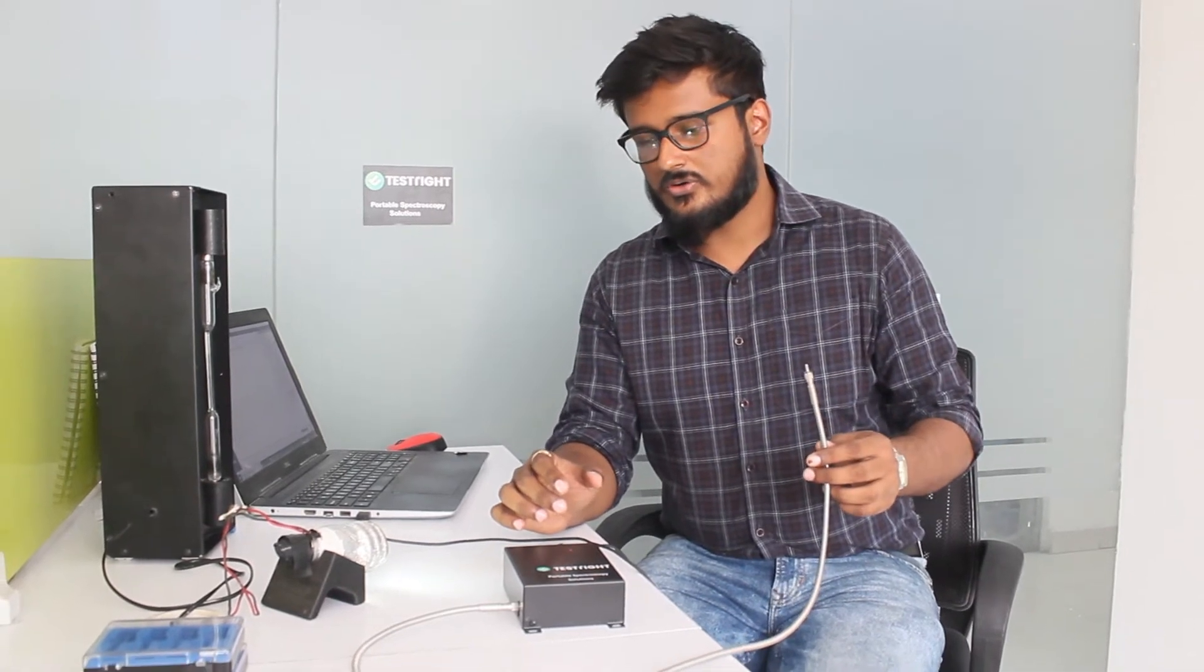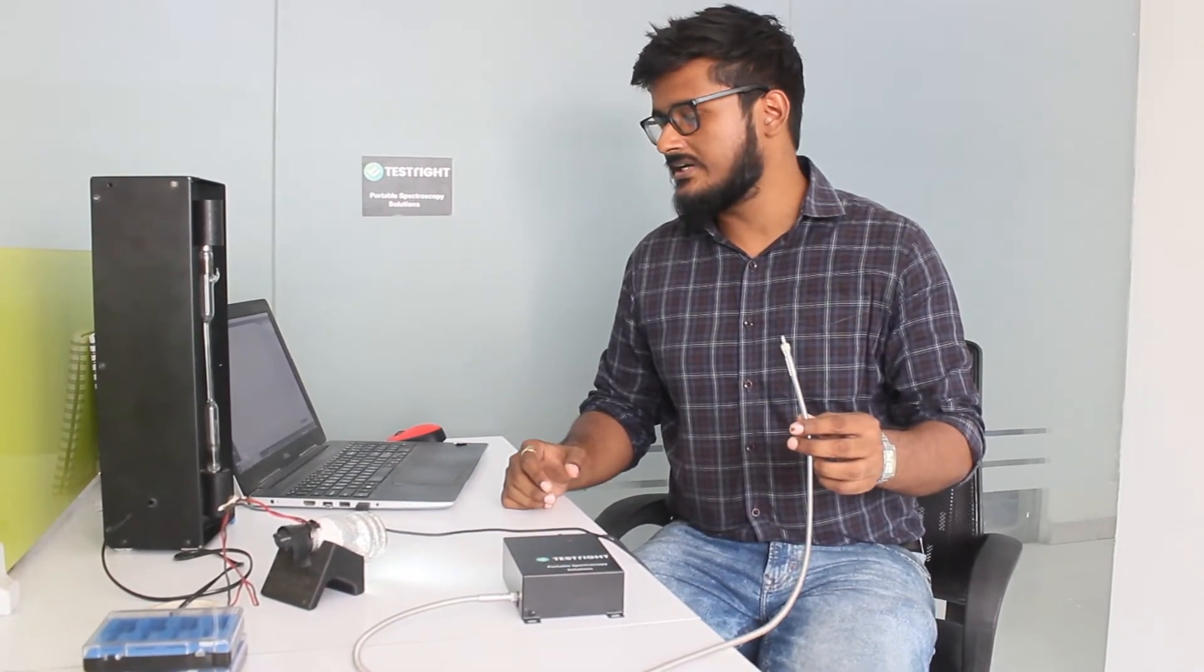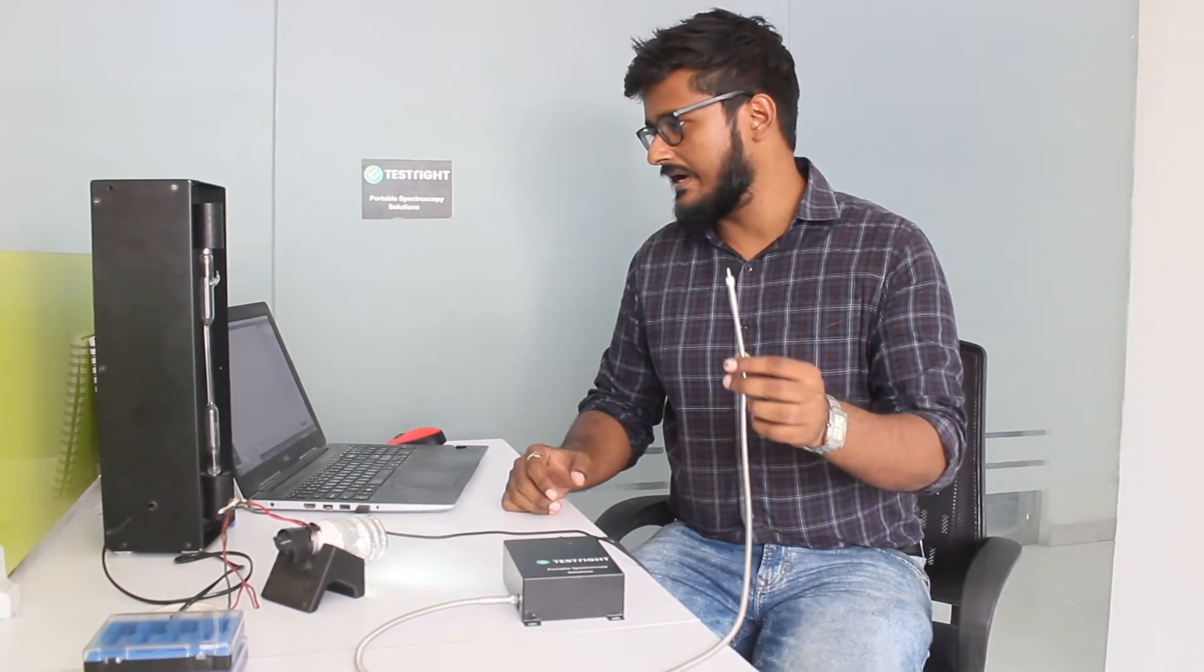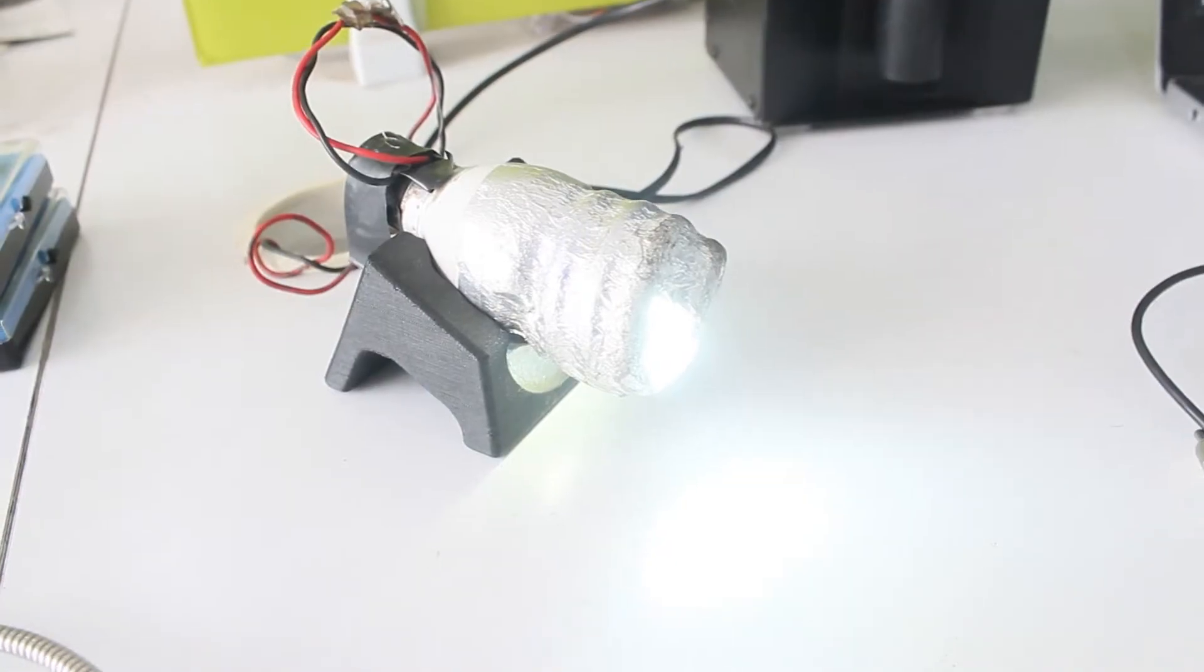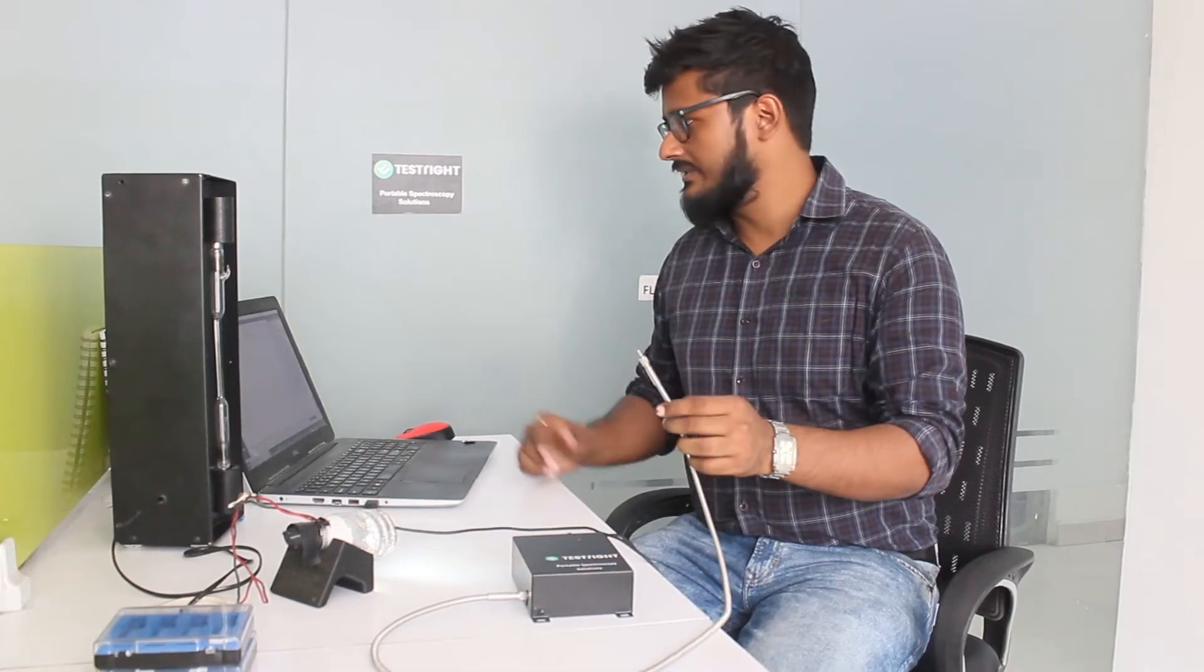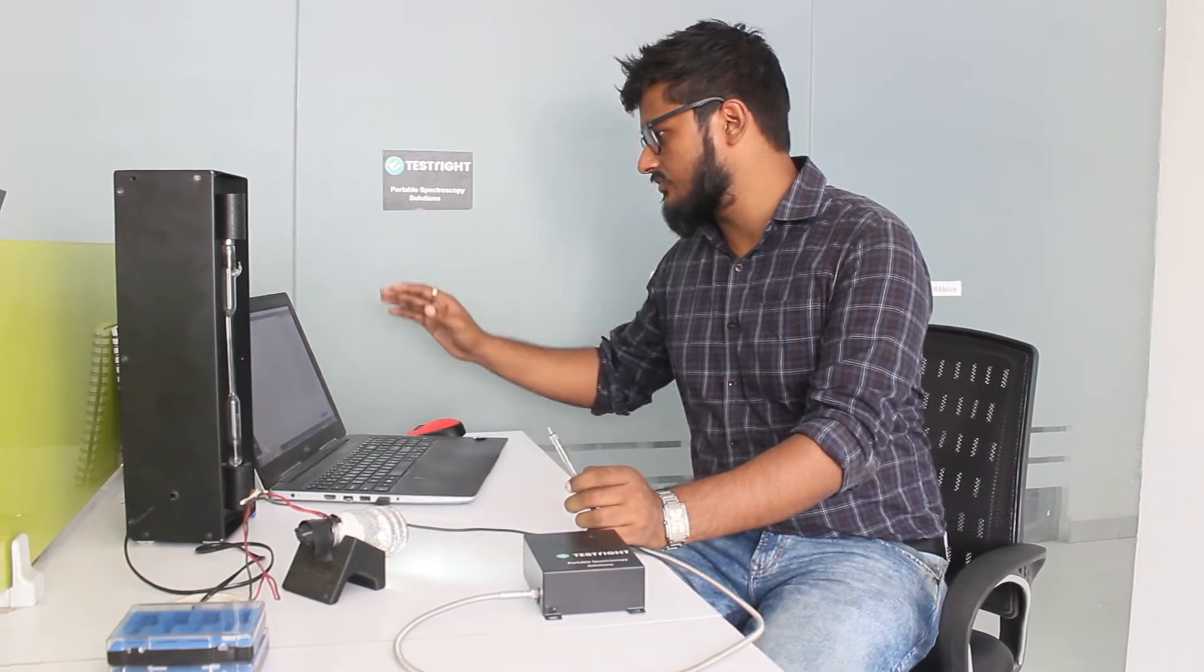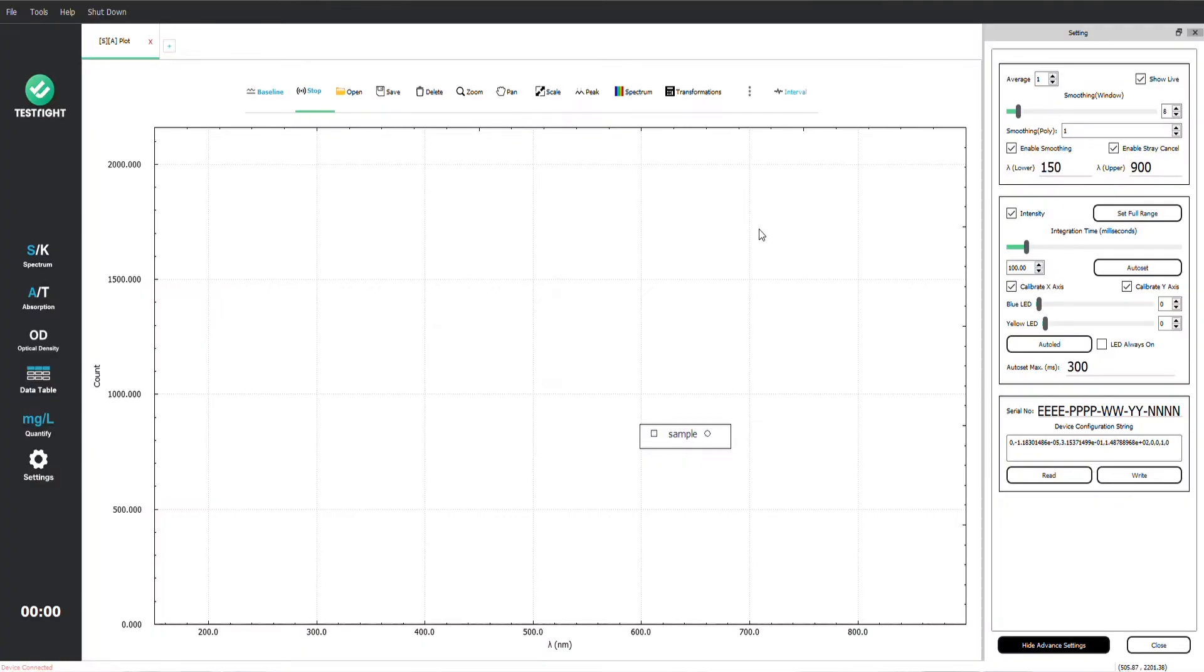We are going to study some light sources. First we have a CFL lamp and the device here, you can see this is our software interface. It is currently in the live spectra demonstration mode.